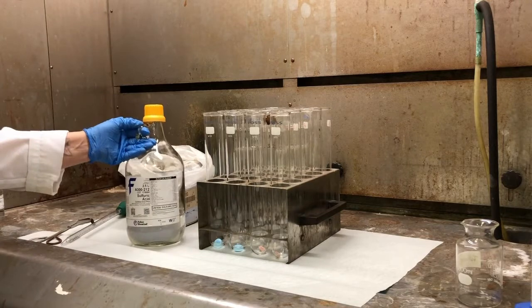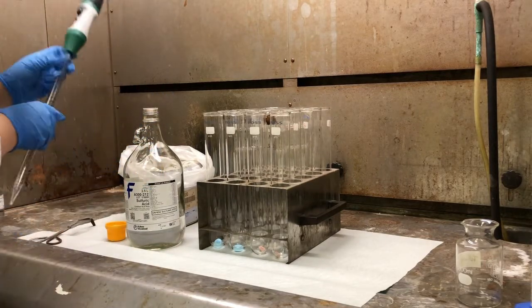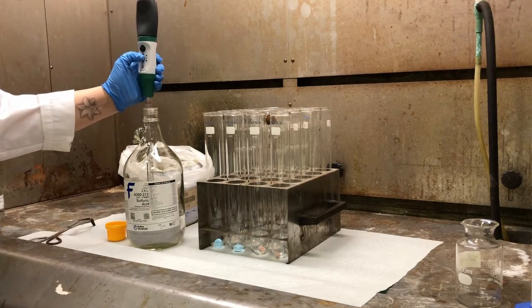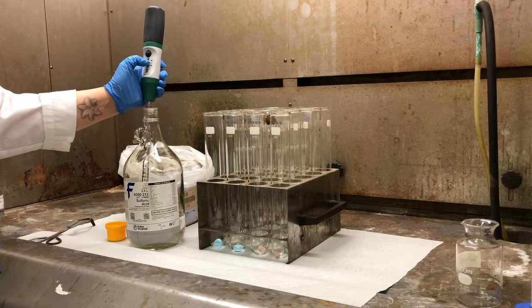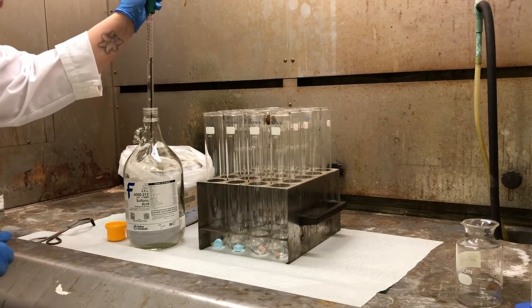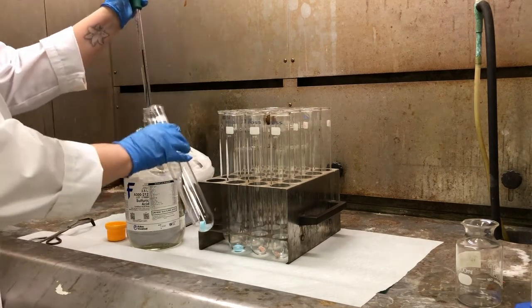And then I'm going to add 20 milliliters of sulfuric acid. So this is concentrated sulfuric acid. I'm wearing gloves because it's obviously very corrosive. I don't want to get it on my skin. So 20 milliliters of that. I'll go to my first tube.